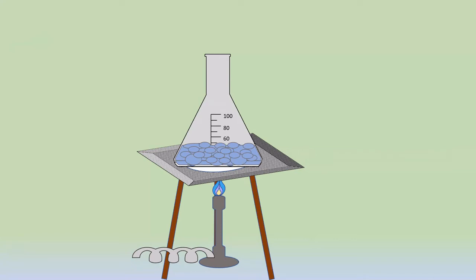Okay, so slowly that white solid is going to get dissolved. You will continue this heating for around 15 to 20 minutes. The solution is going to boil, and the white solid which was formed will get dissolved. In case the white solid is not dissolving, you can add some extra water to the solution. Not much water, don't add too much.